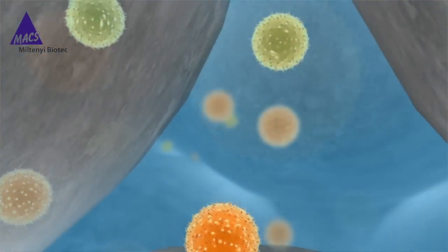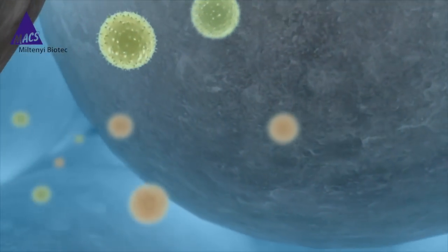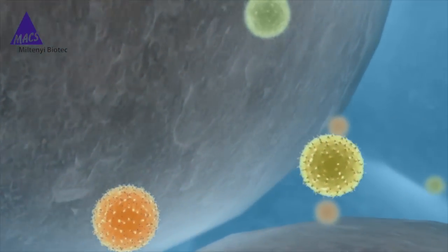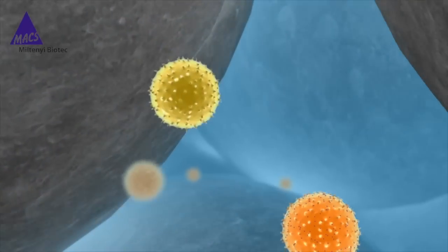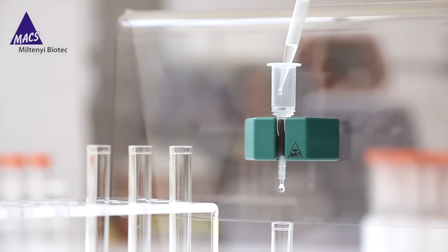The column matrix greatly amplifies the magnetic field. Therefore, minimal cell labeling is sufficient to effectively retain the cells. Columns ensure labeled cells can be washed thoroughly without compromising on yield.